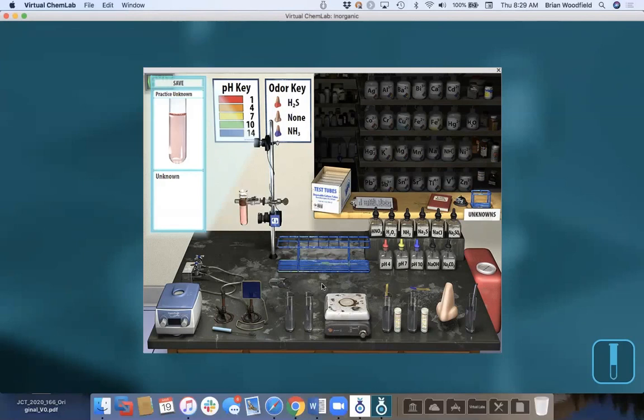It's copper. It's cobalt just because of the colors, but you can have them go to sodium hydroxide, centrifuge it, decant, and now you're left with that. Go to ammonia, and so you get that. So I can go to pH. I can confirm it by adding carbonate, going to pH 10 here, and adding some carbonate, and it doesn't work because I have the amine complex, pH 7. So I know it's copper.